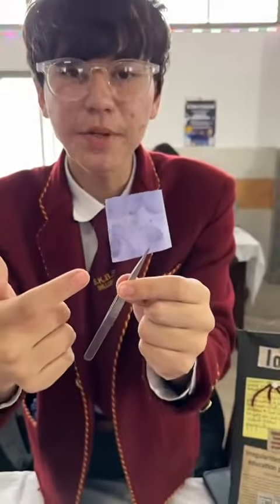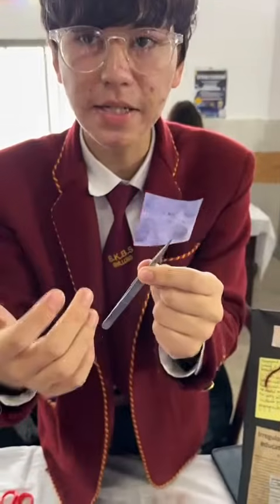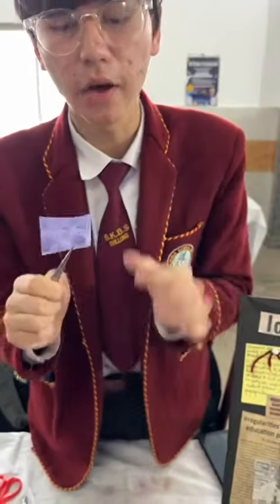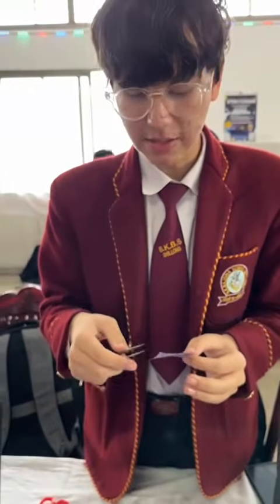I can analyze and compare the fingerprints found at the crime scene with the fingerprints of the suspect. So this is how culprits are arrested if fingerprints are the evidence.